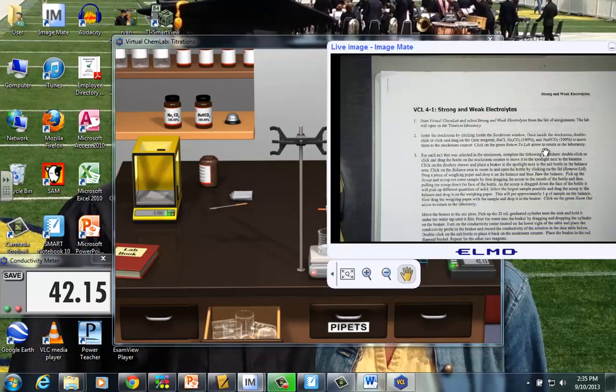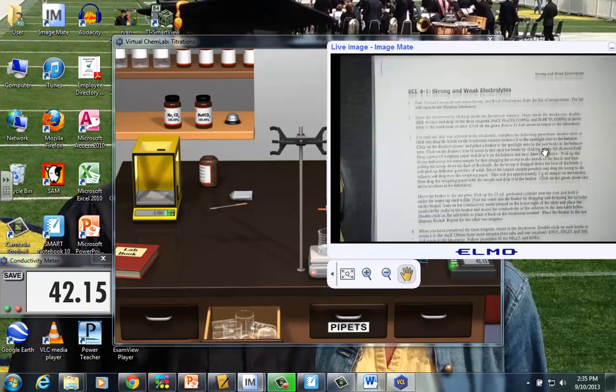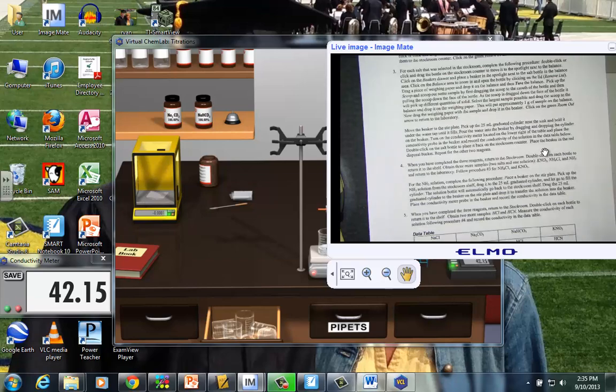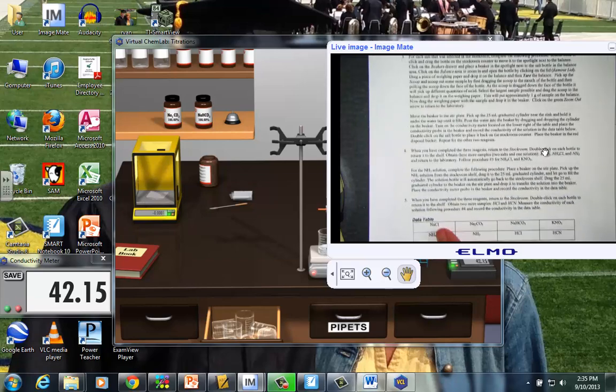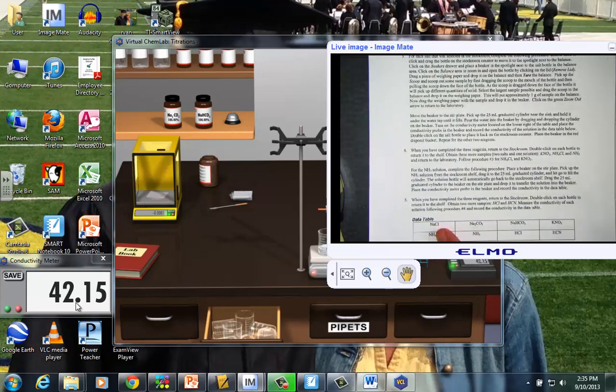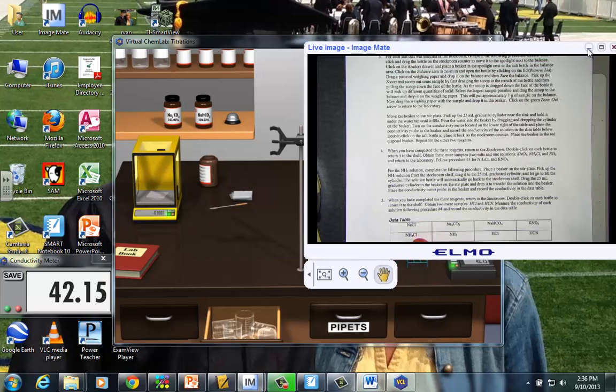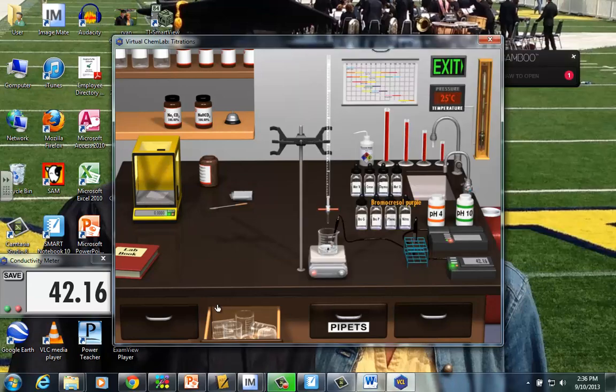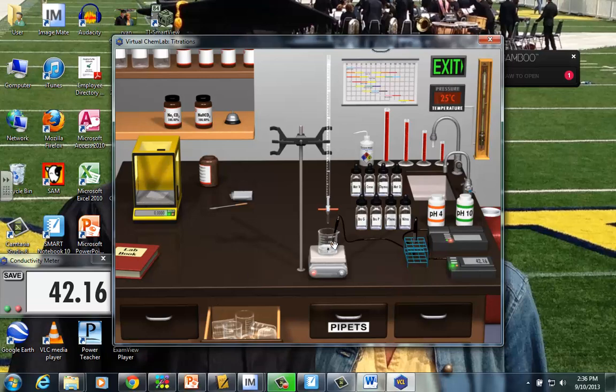So, what we're going to do. See this value here. The NaCl in our data table. We're just going to grab the 42.15 and just simply record it there. And we keep going. Since we've got a lot of testing to do.